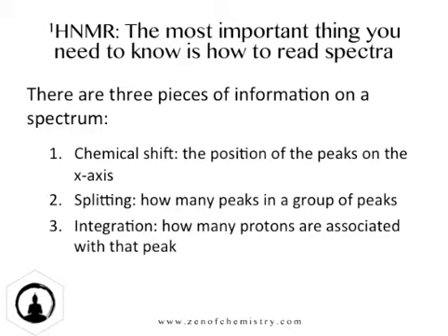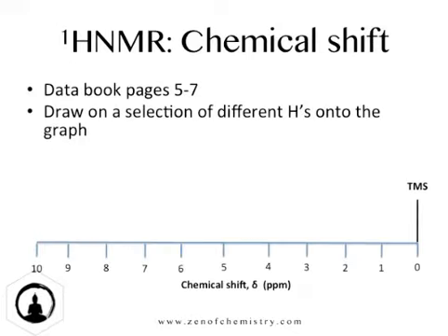I'm going to start with proton NMR. If you're studying VCE chemistry, you'll see that in the data book pages 5 to 7 is your NMR chemical shifts. What I like to do when I'm introducing NMR to students is get them to draw their own NMRs. If you can draw them, you can actually read them.